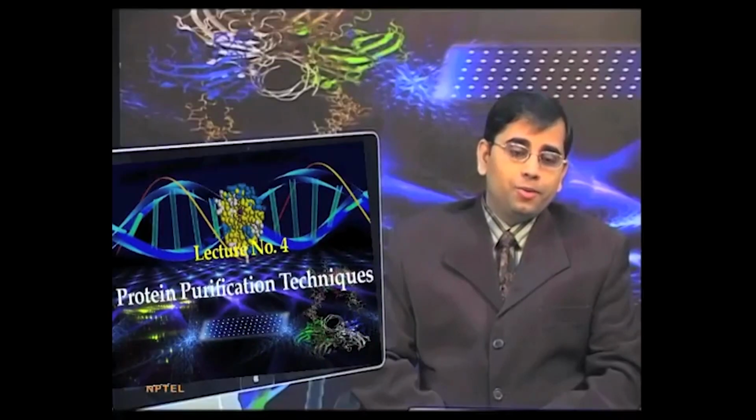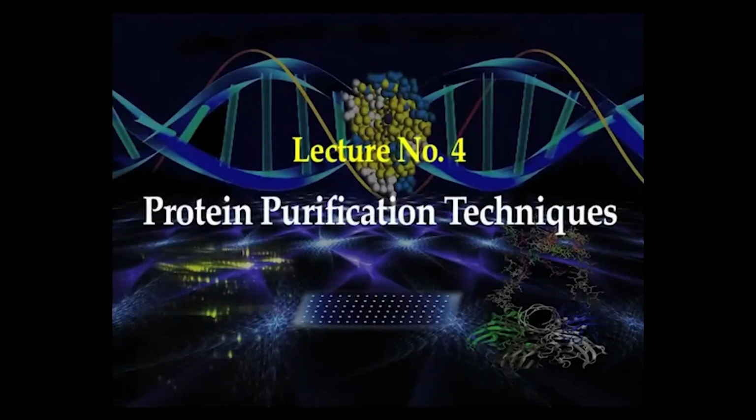Welcome to the Proteomics course. Today we will talk about protein purification and peptide isolation using chromatography methods.